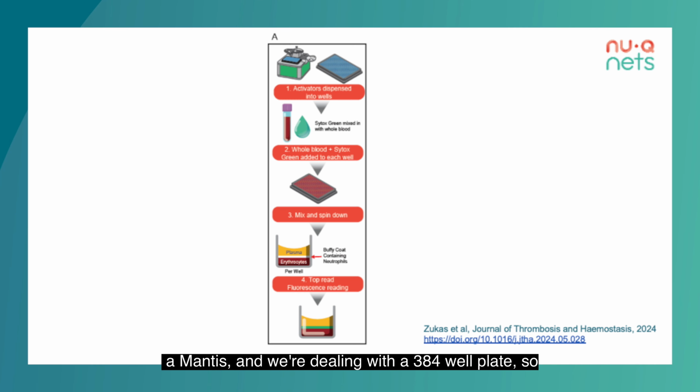It's quite amazingly high throughput, what we can do. The order in which reagents are added is mapped out using the mathematical program MATLAB. And so we can program and test a large number of molecules all at the same time and try and pick out their signal. This actual panel is the control work.